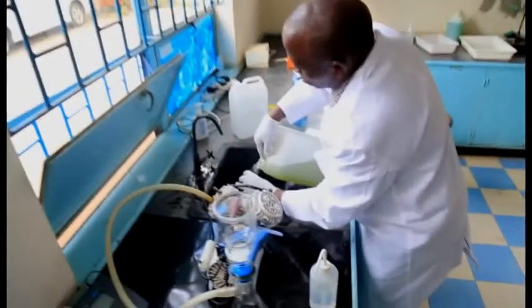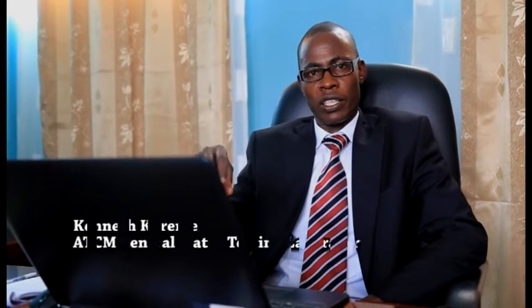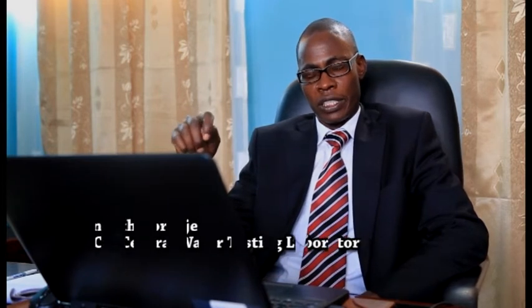Full chemical analysis focuses mainly on the physical-chemical characteristics of water to determine the chemical suitability of water for domestic use. While on the side of bacteriological analysis, we mainly focus on 2 bacteriological indicators, mainly E. coli and total coliforms, because these are the approved indicators which are normally used to determine whether any type of water is suitable for drinking purposes.